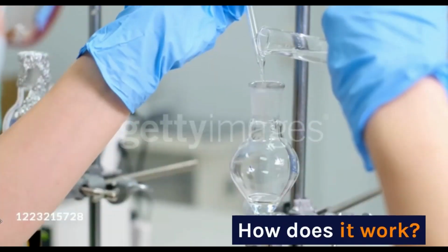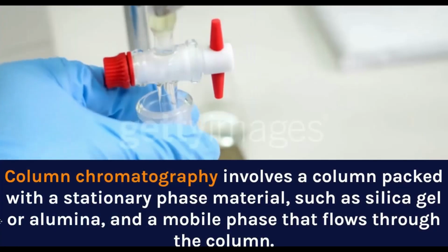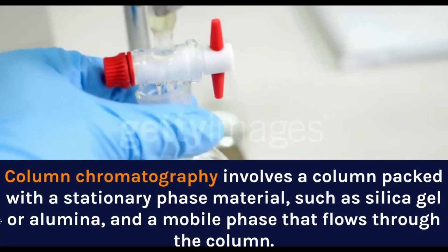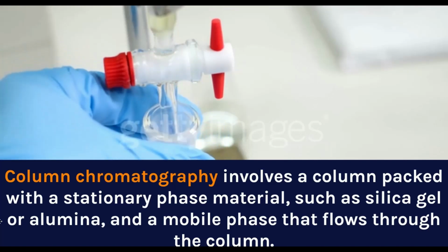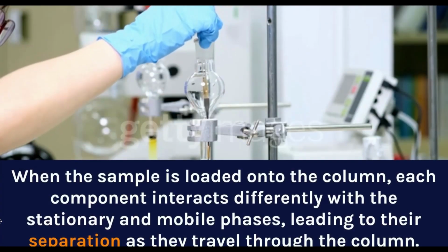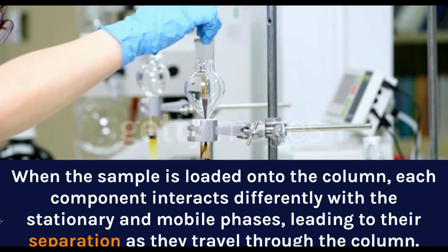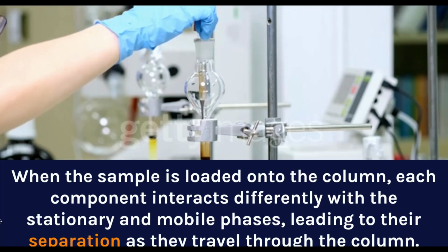How does it work? Column chromatography involves a column packed with a stationary phase material, such as silica gel or alumina, and a mobile phase that flows through the column. When the sample is loaded onto the column, each component interacts differently with the stationary and mobile phases, leading to their separation as they travel through the column.